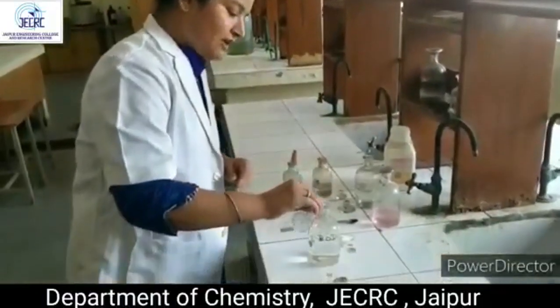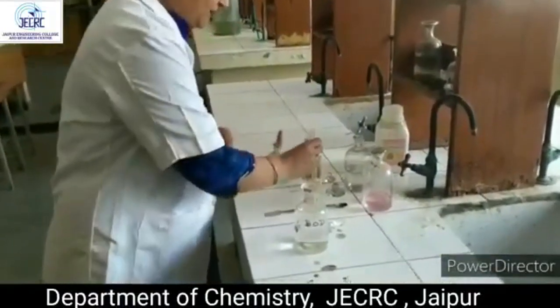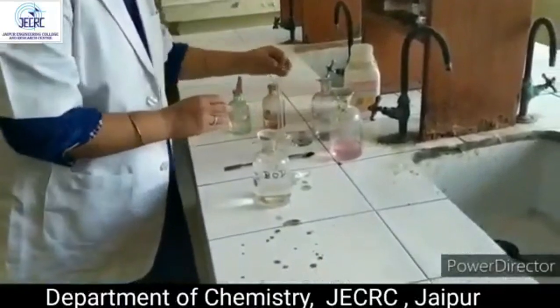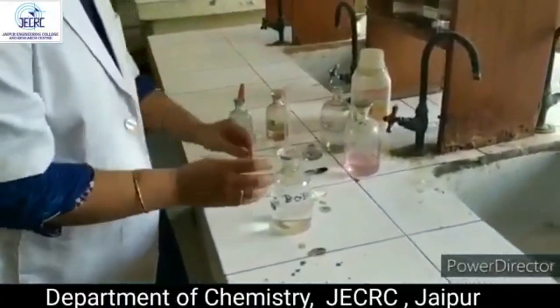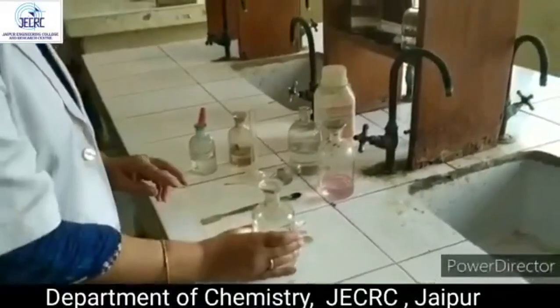This titration is an iodometric titration, which means that iodine is liberated in this titration. Now all these three contents we have added in this BOD bottle.